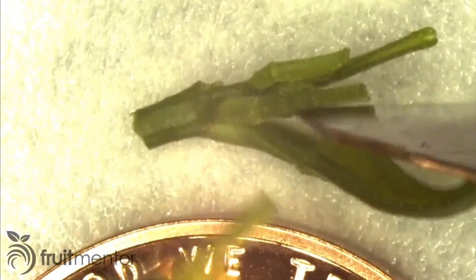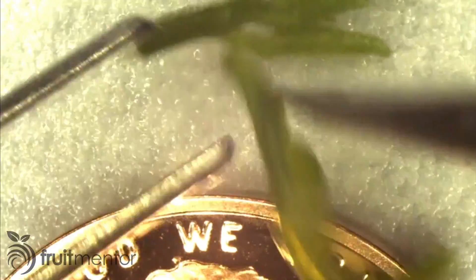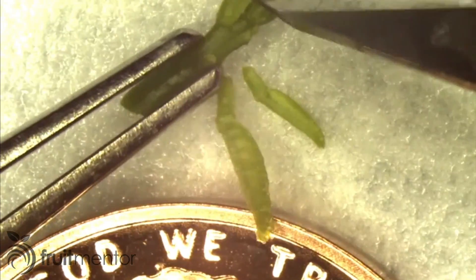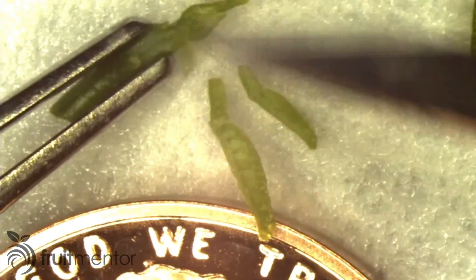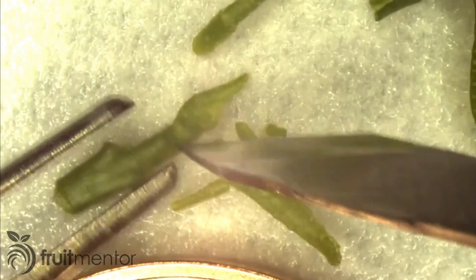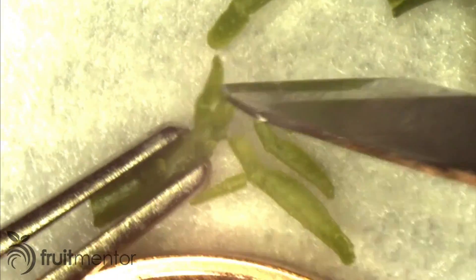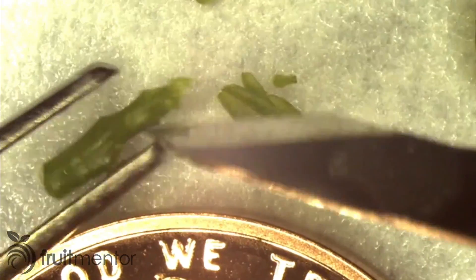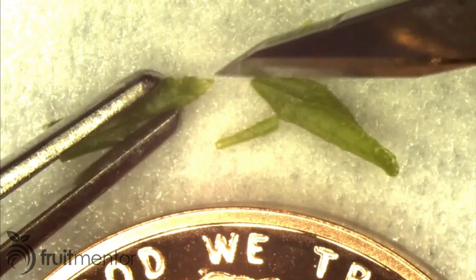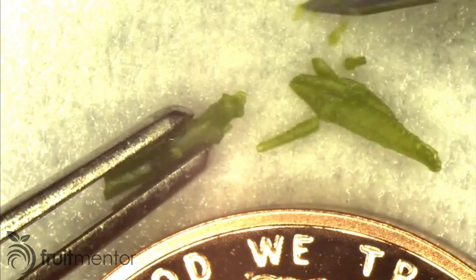This shoot may contain bacteria, viruses, and other organisms that can cause diseases, but scientists have discovered that the very tip of the shoot is free of disease-causing organisms. These organisms have difficulty invading the very tip of the shoot called the apical meristem. By cutting off this healthy part of the shoot tip, it is possible to grow a tree free of disease-causing organisms.